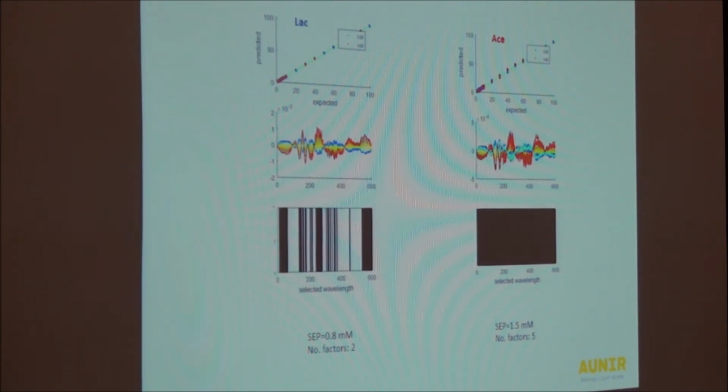That shows that you can really linearize the system by applying these filters and focus only on the chemical information. And you can see the colors showing the gradients. They very clearly have linearized the response.